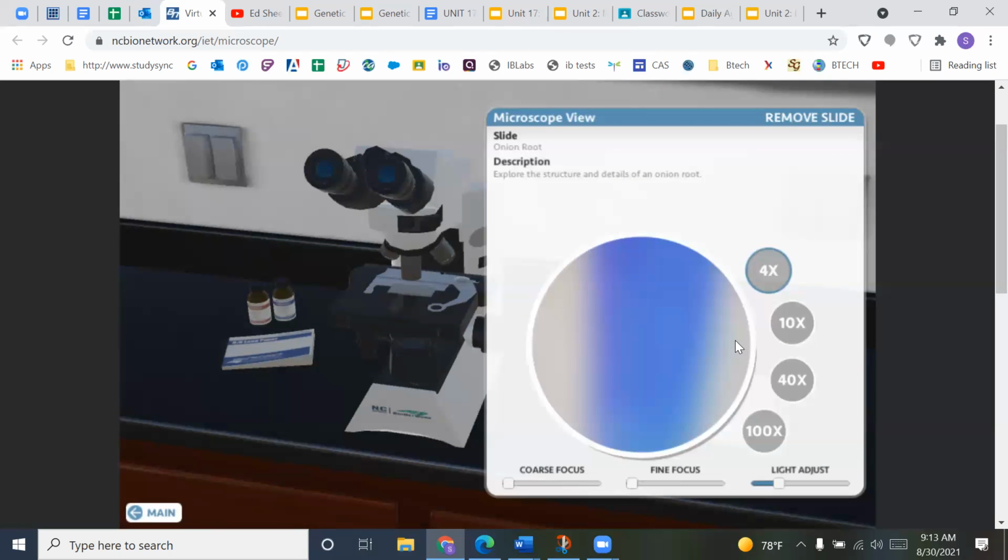If you feel like you have fingerprints on a slide, or if you need to clean a lens on your microscope, I will also put some lens paper over here. You do not use your shirts or anything other than lens paper. Okay? So you can tear out a piece of lens paper and clean whatever you need to clean. Here's our lens paper. It's just like thin paper that will not scratch your microscope. Okay, but it will take away fingerprints and oils.